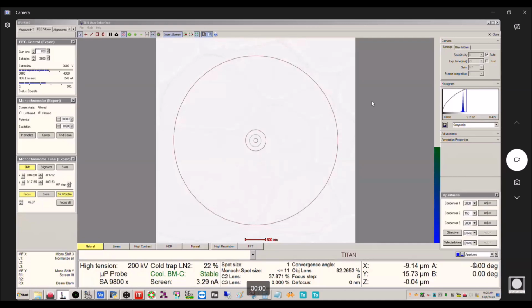Okay, so now it's loose. Now it's not. Okay, we'll see if this, all right, we'll have to just deal with this here, but this was causing drift in the stage.